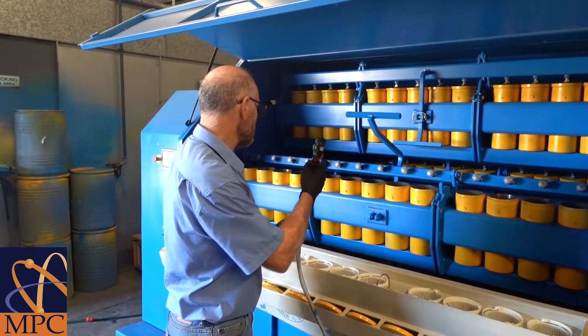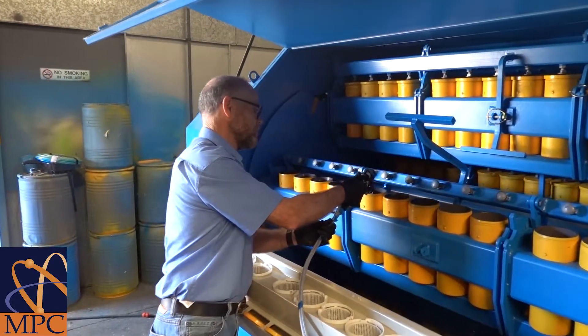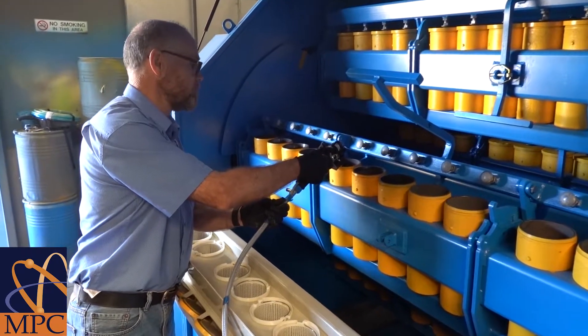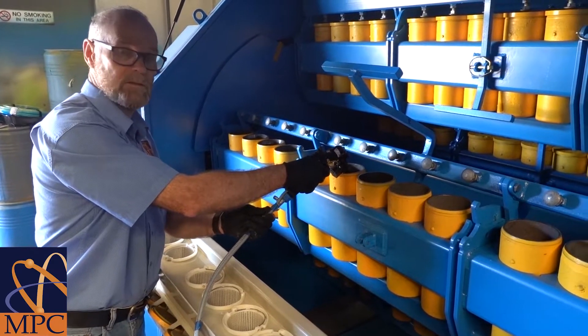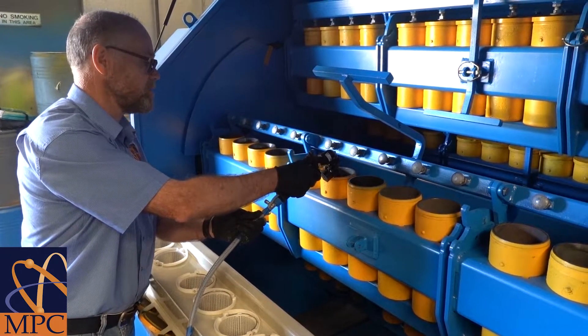We add one litre of water from our mains programmable water dispenser into each of the pots prior to adding our samples.